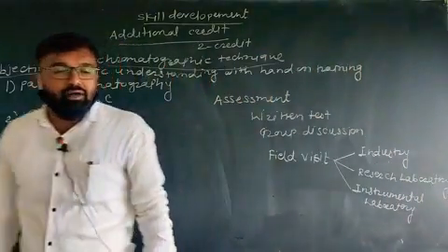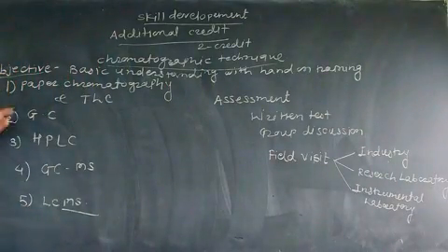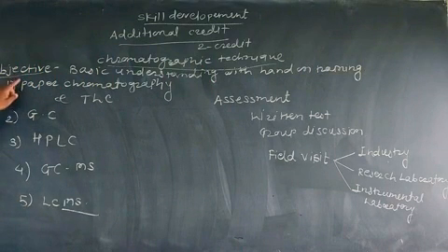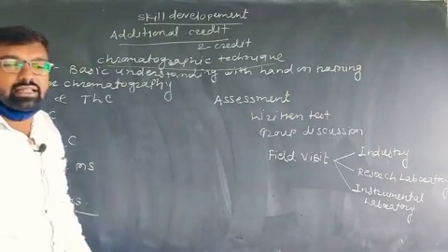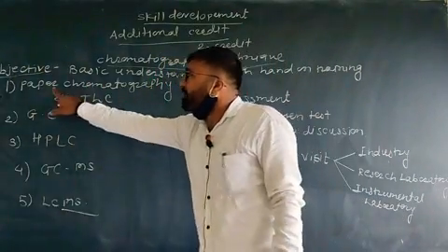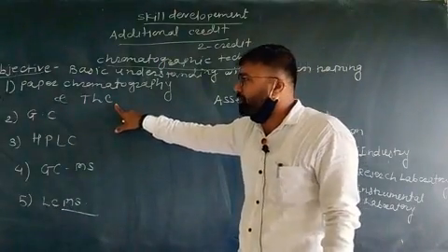The topics for skill development, that is chromatographic technique, for both semesters include 5 different topics. All topics are related to chromatographic techniques. The different kinds of chromatographic techniques are studied in this semester and next semester too. For that purpose, topic first is paper chromatography and TLC, that is thin layer chromatography.